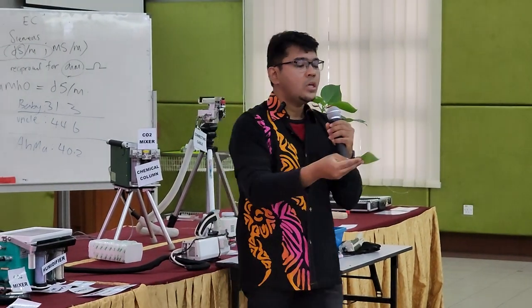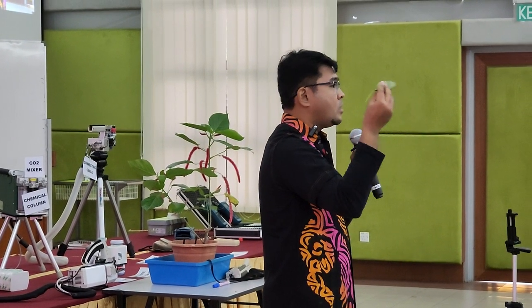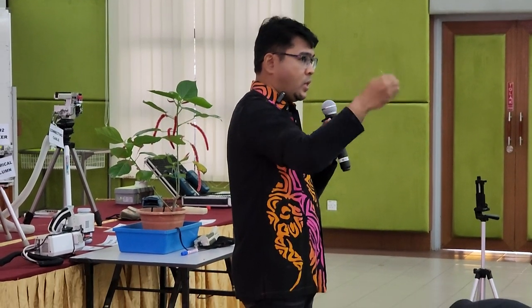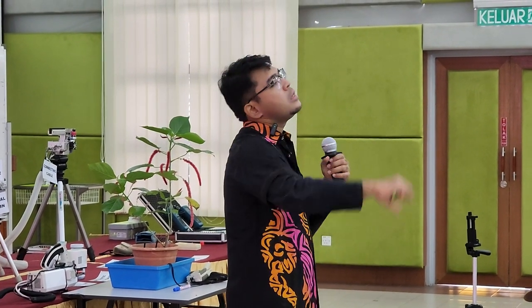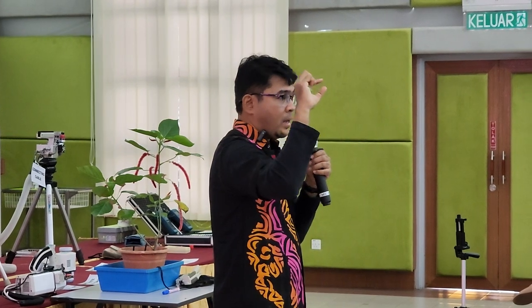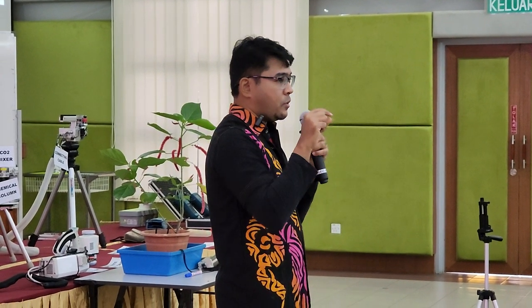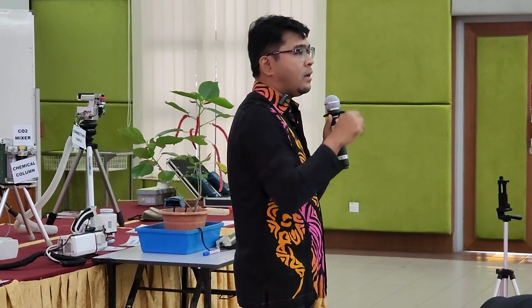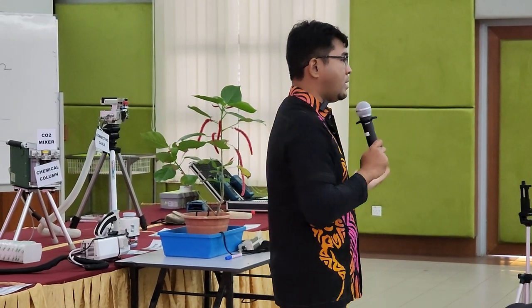You take the leaf here, you need to extract the chlorophyll pigments out of this using solvents such as ethanol and acetone. So you crush it, you use the pestle and mortar, bang it, grind it, you get your pigment extract. And this pigment extract, you send it to the lab. Our lab actually has the spectrophotometer. So this spectrophotometer will tell you the absorbance, which you can use in some equations to calculate the pigments.